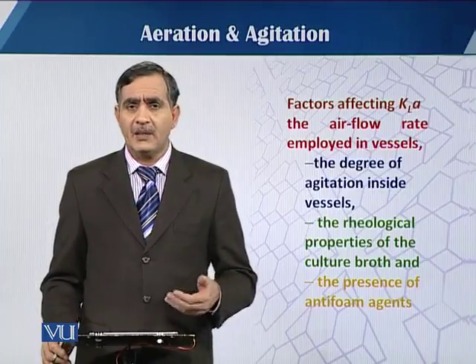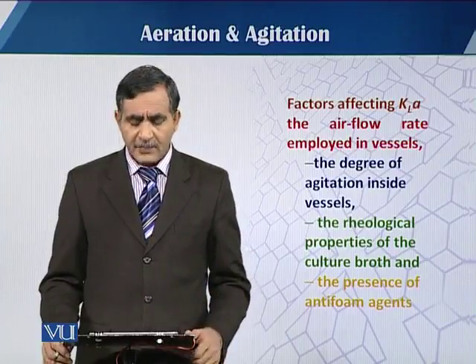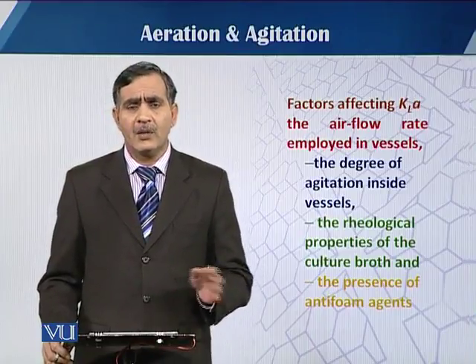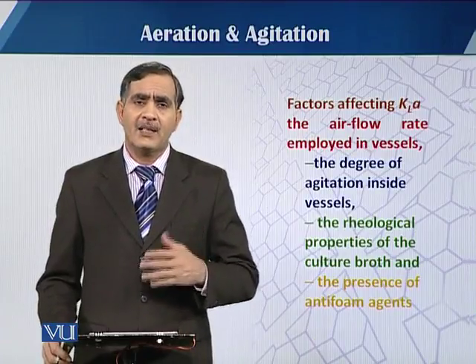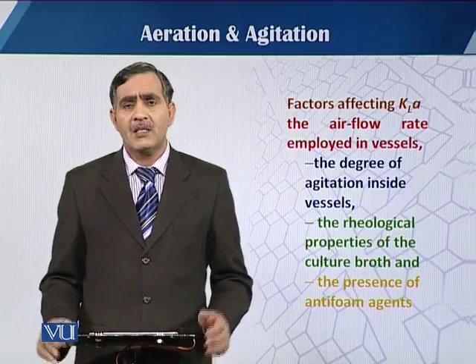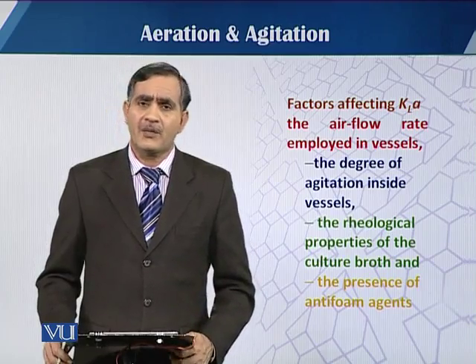So it varies with the agitation rate and with the nature of the fermentation medium, and how that behaves. Sometimes it is also affected when growth happens, because then the rheological properties of the medium change, and also by the type of antifoam. So this is all about aeration and agitation, and the role of aeration in aerobic fermentations.